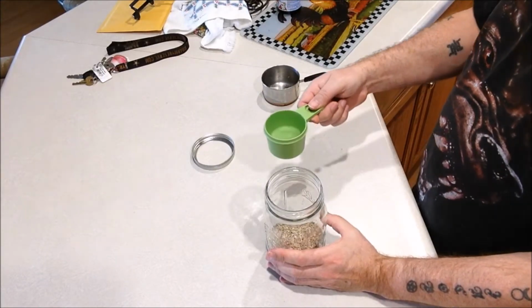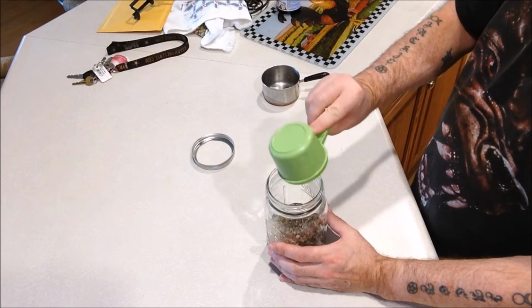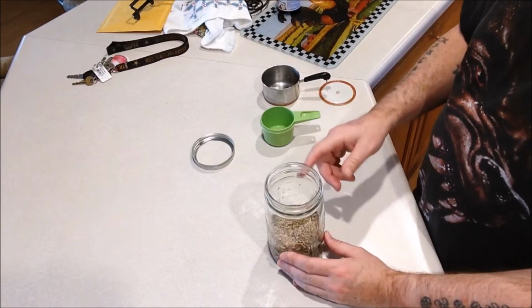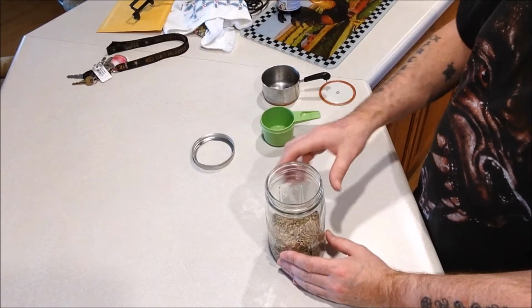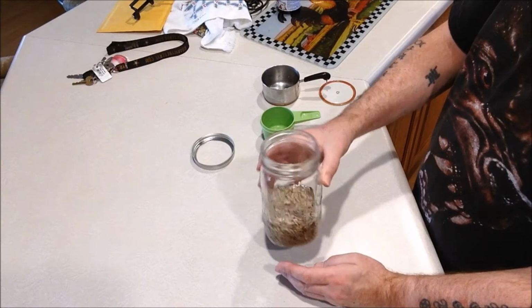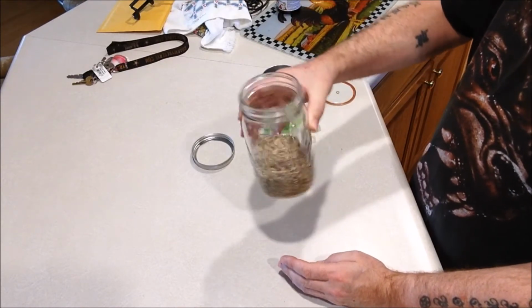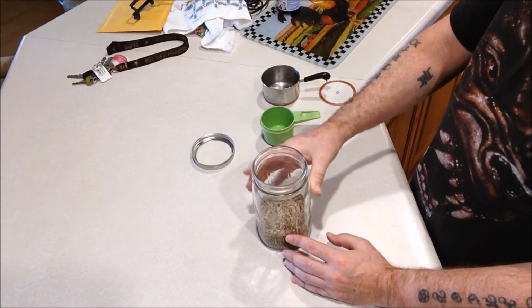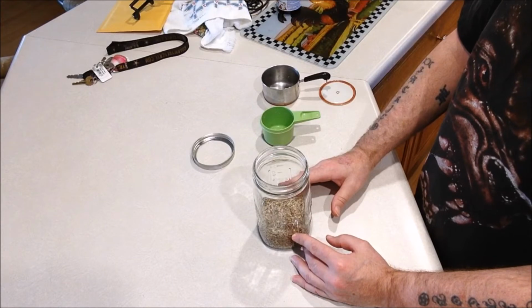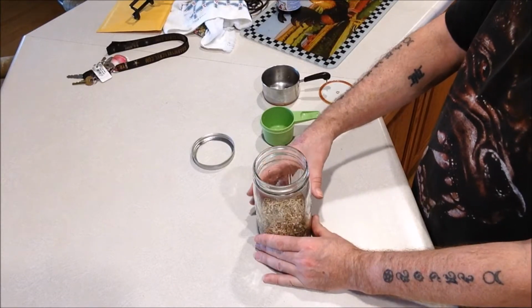Now you just add 2/3 of a cup of water. And if you want to, you can add a little bit of gypsum in there, like 1/8 of a teaspoon, maybe even 1/4 of a teaspoon. But I don't do that. I don't feel it's necessary. You might want to do that if your grain is a little bit dirty and you don't feel like rinsing it, so it doesn't stick together when you PC it.